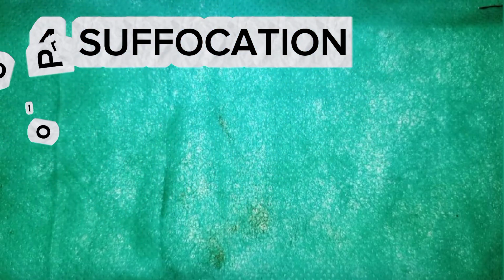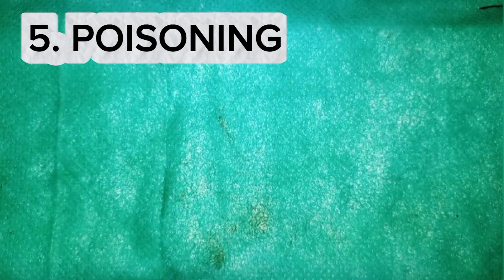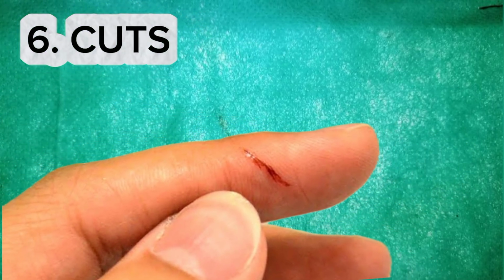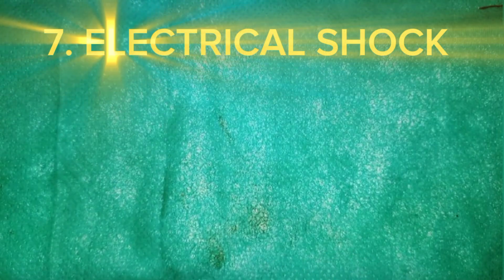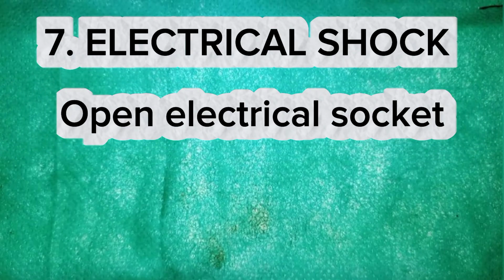Suffocation is caused by poorly ventilated rooms. Poisoning is caused by ingesting harmful chemicals. Cuts are caused by sharp objects and broken glass. Electrical shock is caused by open electrical sockets.